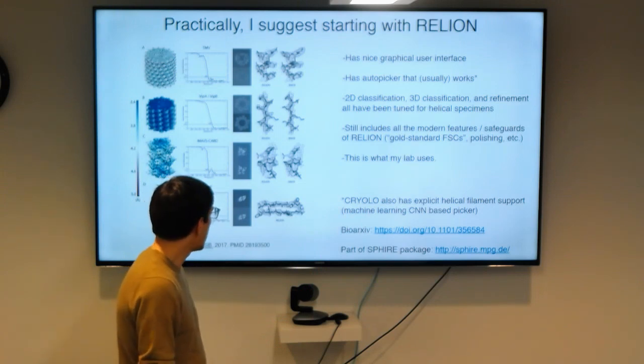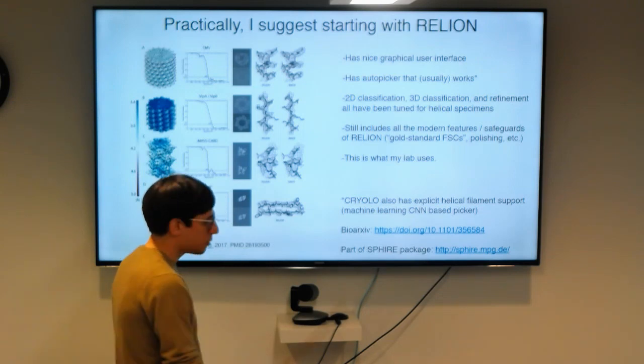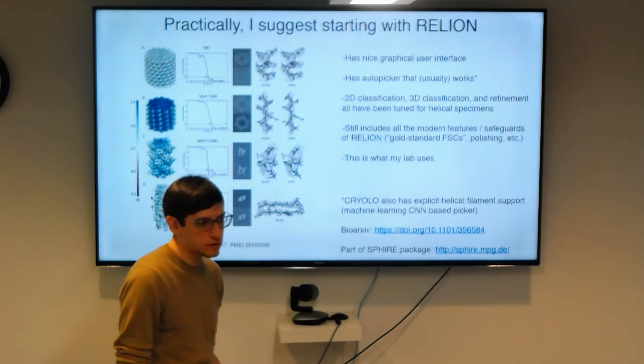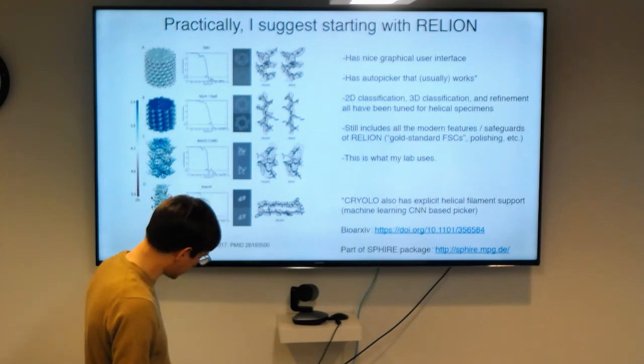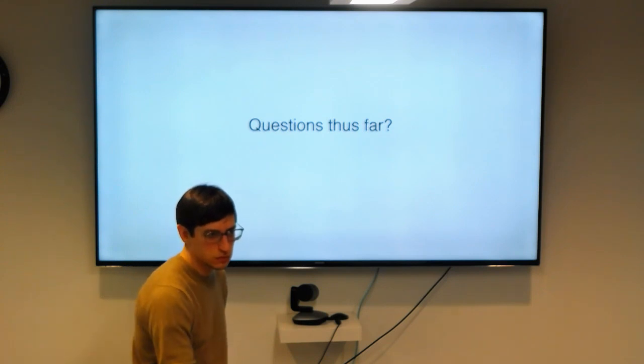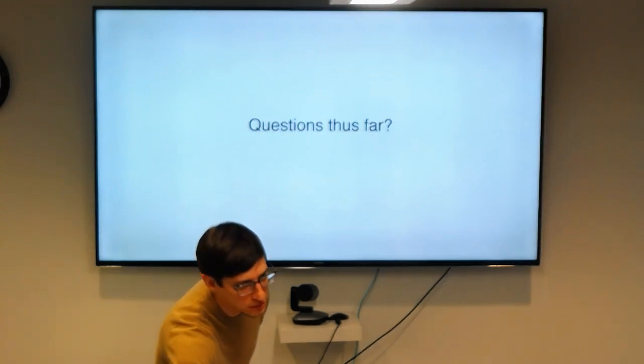So although I gave you a sort of historical overview, you should probably, unless you have a reason not to, use Relion. That's what my lab does. Okay. All right, so any questions thus far? No. Great.